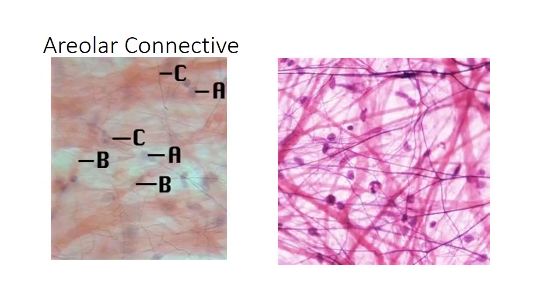Connective tissue, here we have areolar connective tissue. So areolar connective tissue, you find that way down the base of your skin to kind of hold your skin in place, you might say. So areolar connective tissue.